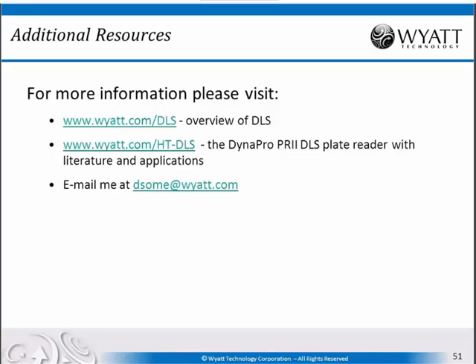All right. From Balaji, how do you automate measurements with the DLS system? Okay, well, you load your solutions into the plate. The software allows you to set up a list of conditions, which sample is in which well, which buffer conditions, all the information you need, which pH, which salt concentration, all these things will be loaded in via the software.